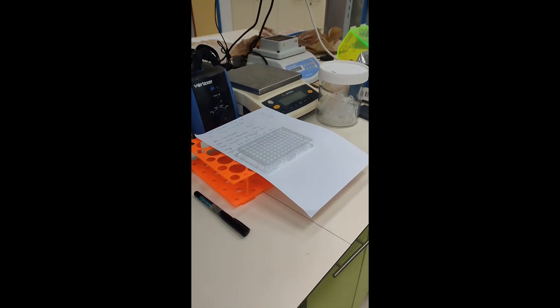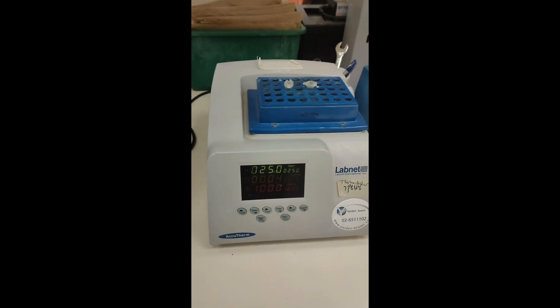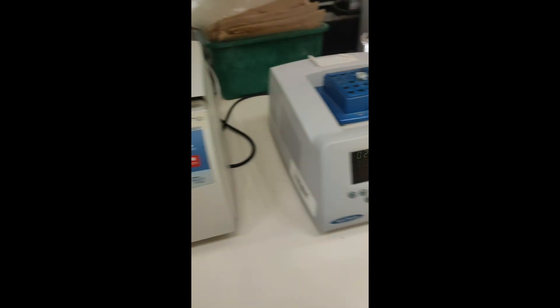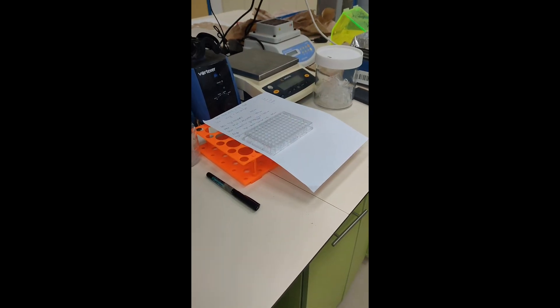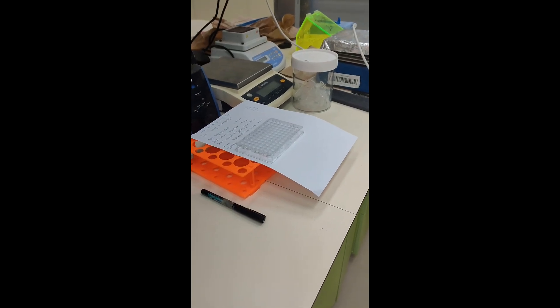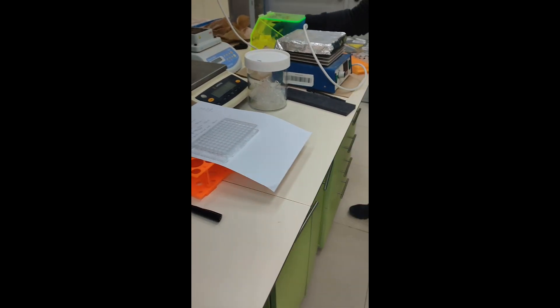We have 10 minutes for the thermal shaker and then another 10 minutes for the centrifuge, so we have 20 minutes in the meantime. We're going to use this time to prepare the calibration curve.